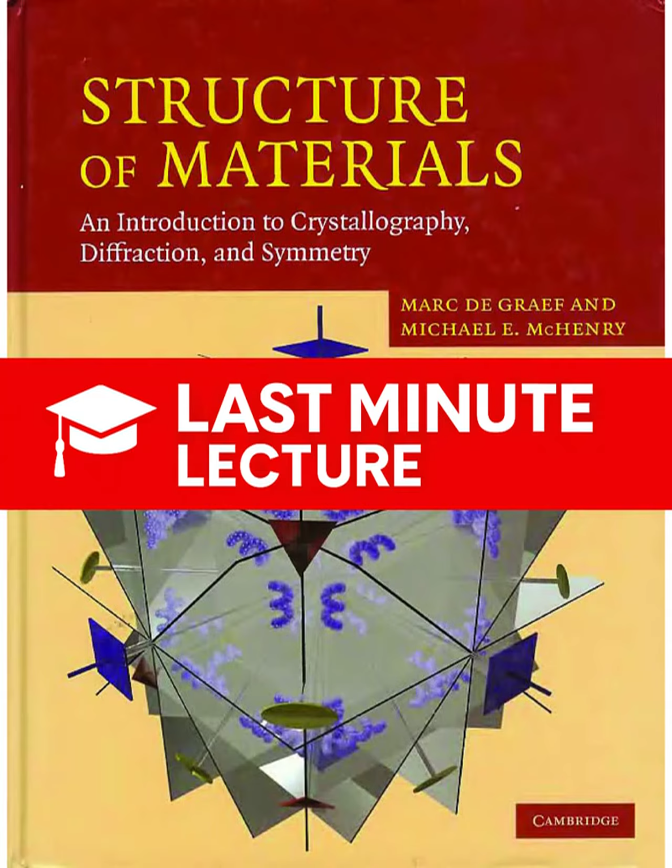Correct. Since the arrangement of ellipses or hyperbolas reveals the twofold, threefold, or fourfold axes, mapping these spots onto a stereographic projection allows researchers to quickly identify the major crystallographic directions, like 100 or 111, relative to the incoming beam. So the Laue technique is an essential, rapid tool for just determining the orientation of a single crystal. It's the geometric key to unlock the symmetry. That's a great way to put it.